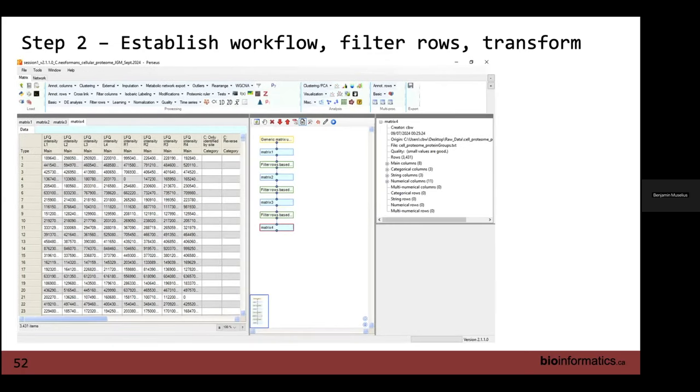All right, so you'll go through that, do the different steps. You should be here. So 1, 2, 3 filters.